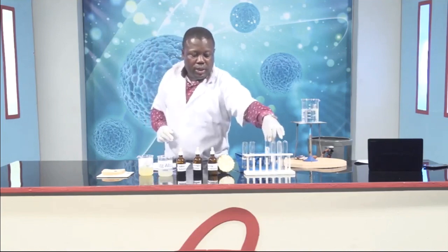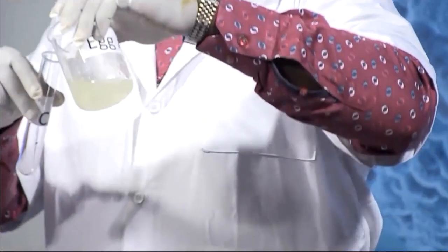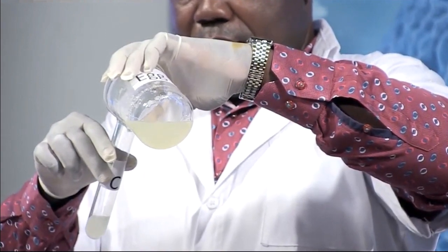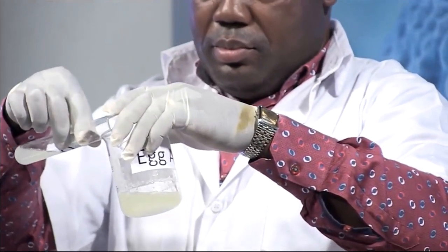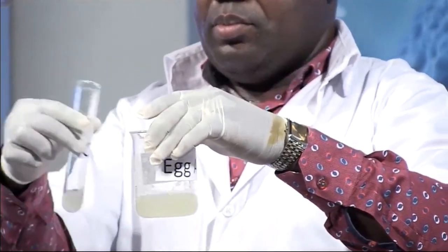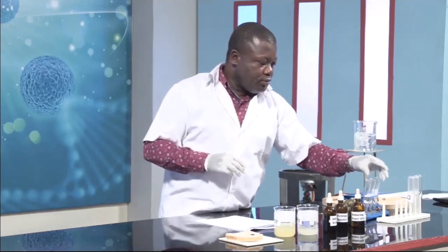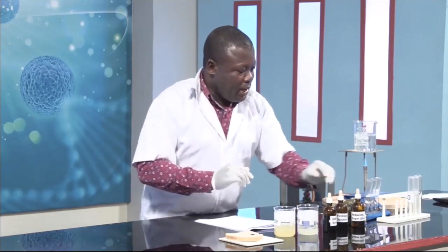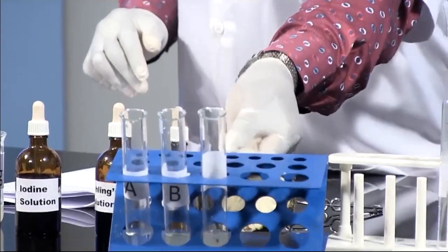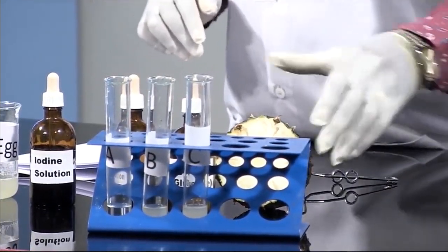Then we take test tube C. The content will be egg albumin. So we have our A, our B, our C.